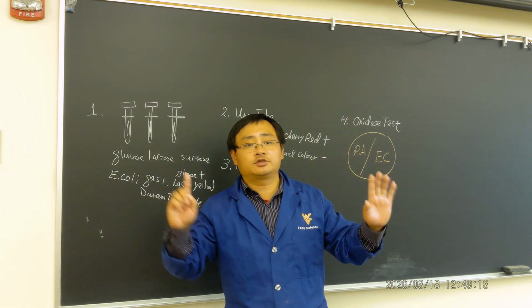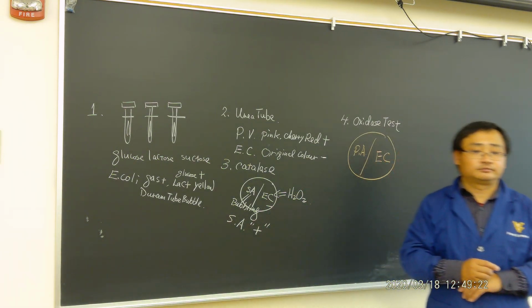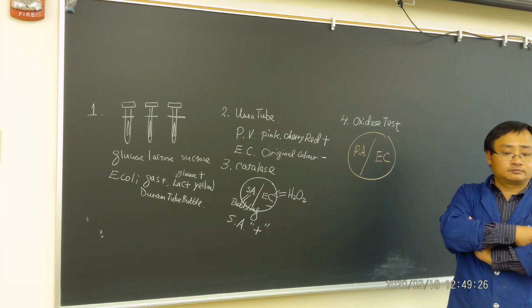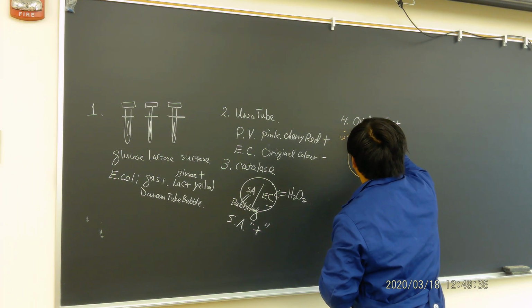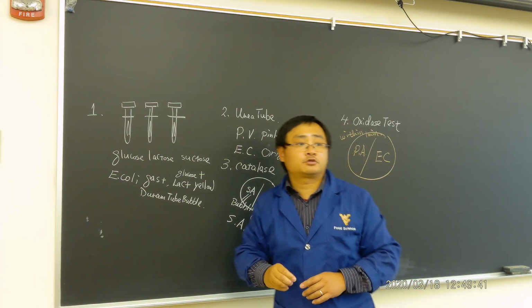You see which one turns purple. Then you'll see which one is positive. It's very obvious within 1 minute. You have to do this within 1 minute, remember. Which one is positive?